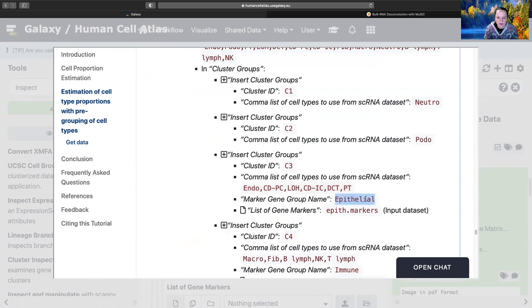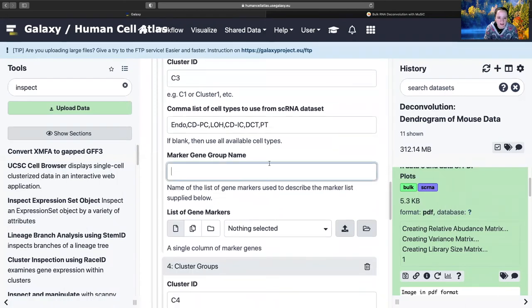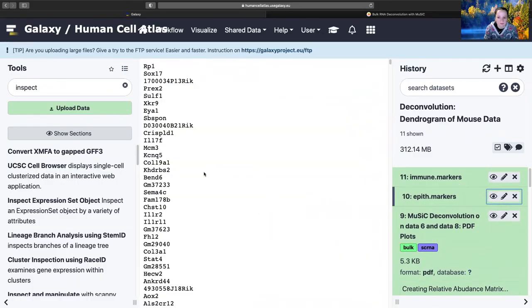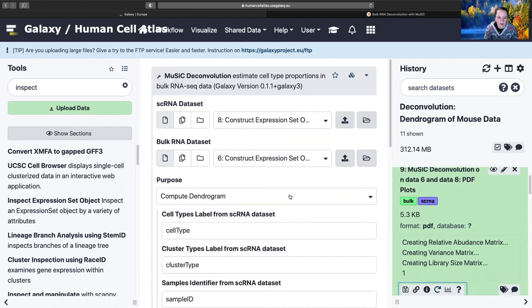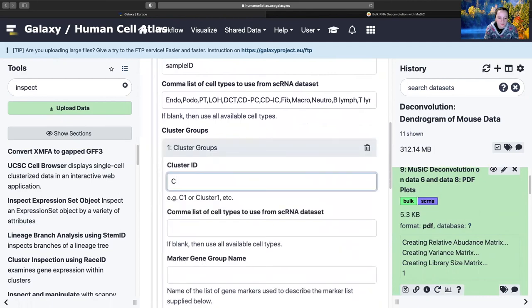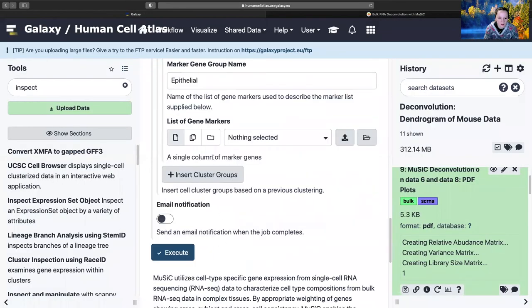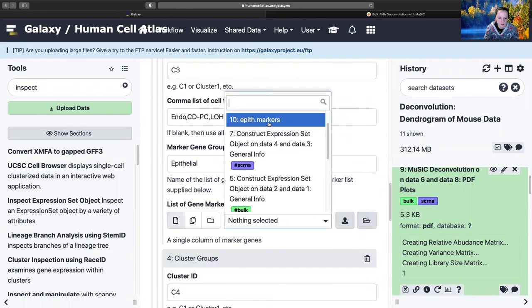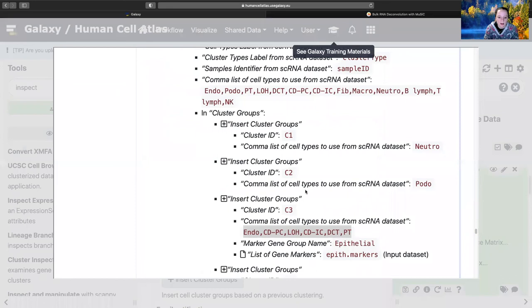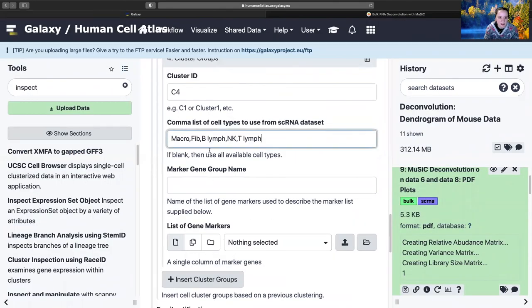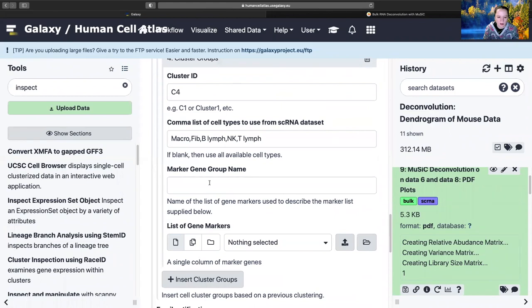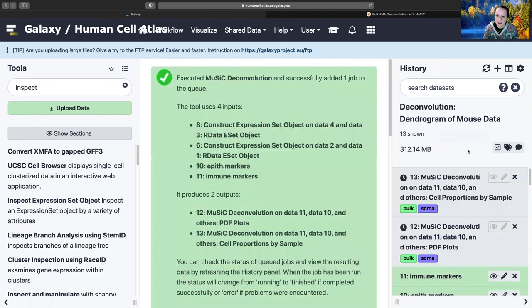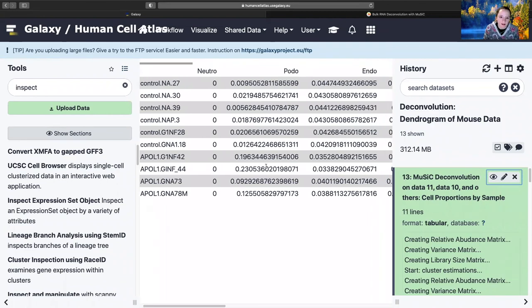And again, these genes can distinguish the immune cells. And then we hit go. I'm stretched now, chums. Cool.